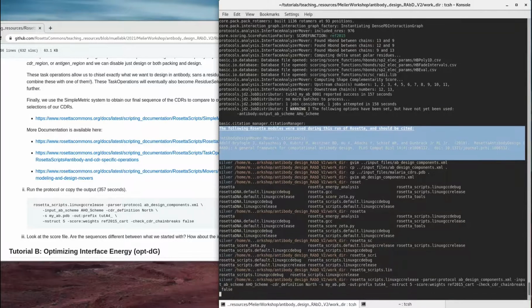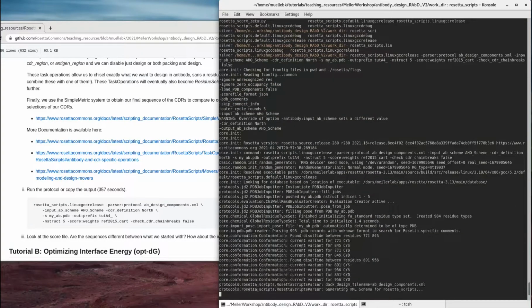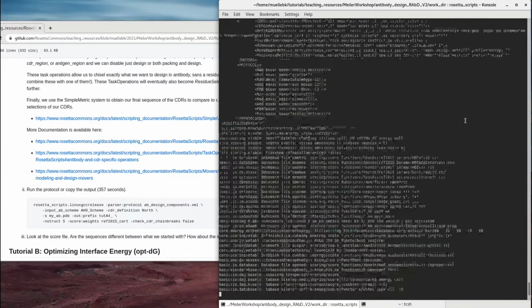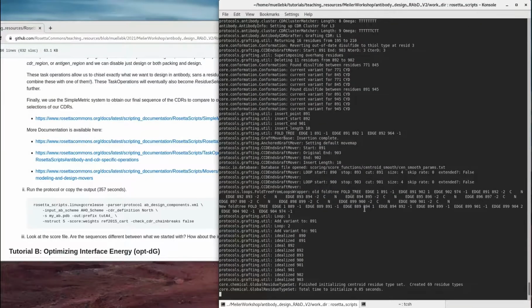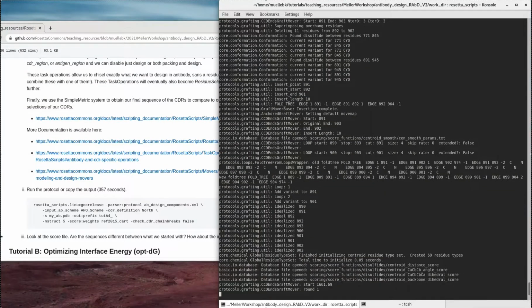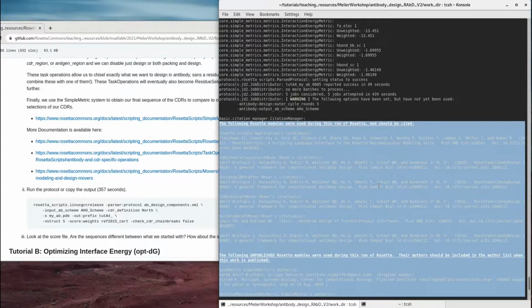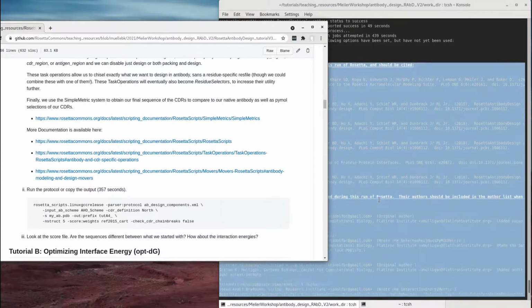And we'll run that. And this will take about 400 seconds, maybe a little less. Once again, not going to sit through and watch all of this, but as you can see, it started running correctly, and so we'll let this run. Alright, that's finished running. Now you can see that this has taken about 440 seconds, so a little longer than what was shown in the tutorial, and that'll sometimes happen.